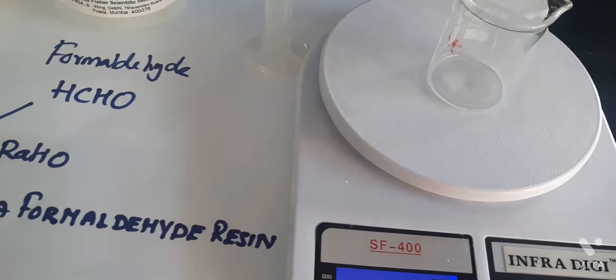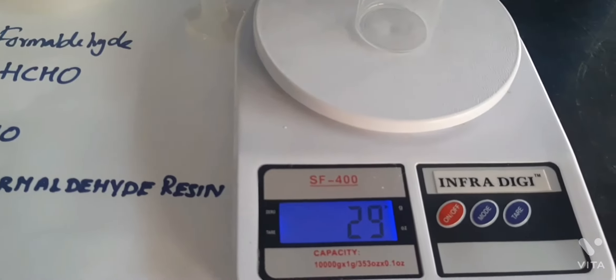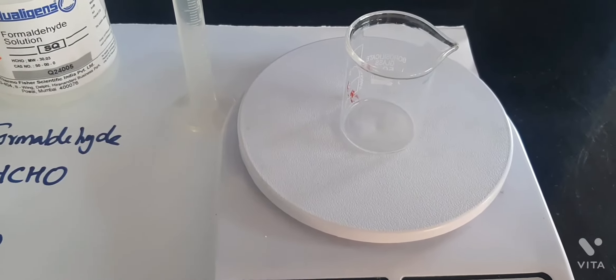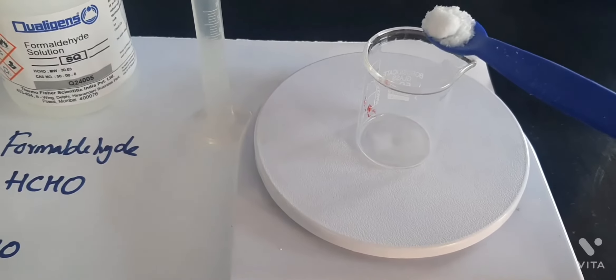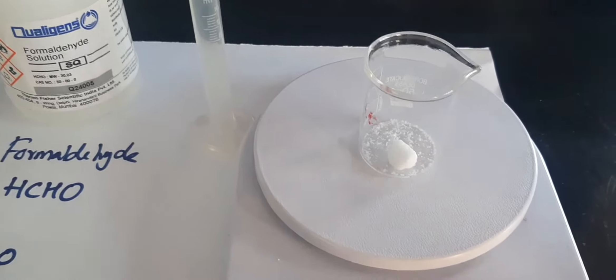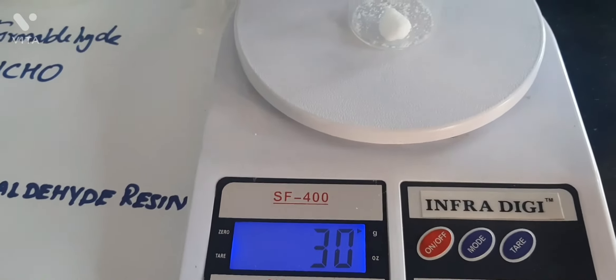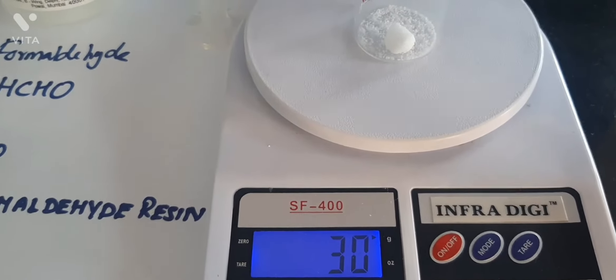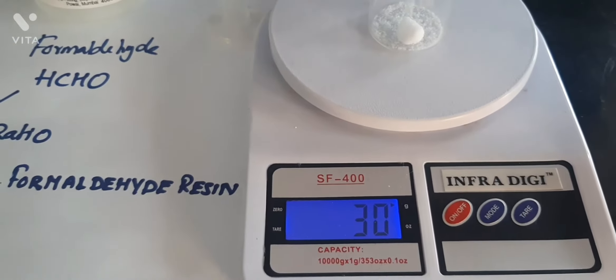As a first step, we should take the weight of the beaker. It is a 50 ml beaker and it weighs around 29 grams. To this I am adding urea. When the weight reaches 31 grams, urea weighs around 2 grams.